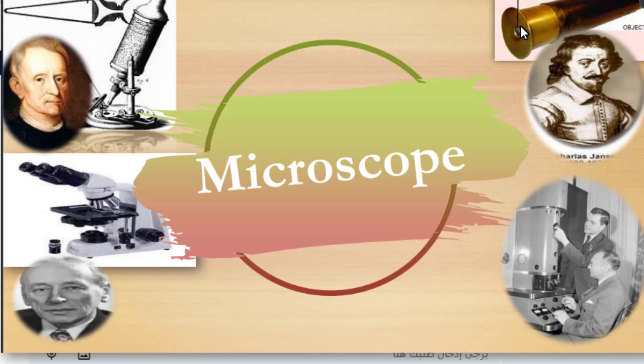Light microscopes are the most common type of microscope used in microbiology lab. They are relatively inexpensive and easy to use. They can't magnify an object as much as electron microscopes. Electron microscopes are more expensive and complex to use, but they can provide much more detailed images of microorganisms. It gives us the microorganisms' size and shape, the cell structure, the motility, movement, arrangement of cells inside the culture, presence of spores or capsules.